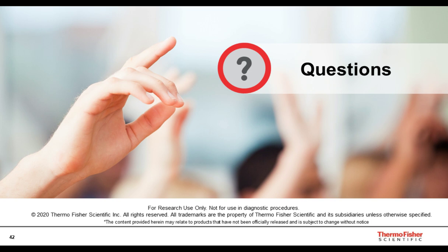And then for the single-stranded donors that we talked a lot about too, the maximum insertion size that we've played with there is about 30 base pairs of insertion. So if you're using single-stranded DNA, we're looking at about 30 bases, and with a double-stranded donor, we're looking at a total of a 1.5 kb insertion.